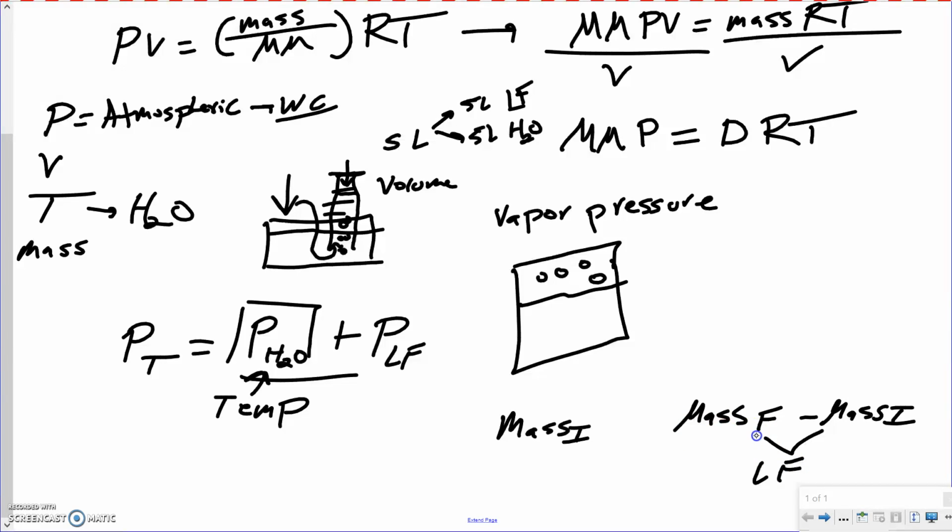Now, the hardest part of this is you are getting the lighter wet. Okay, so you have to remember that final mass will include water weight if you are not careful. You are going to have to do your best to get that thing dried as much as physically possible and to make sure that you get the water out of all the nooks and crannies. Okay, once you have that, you'll be able to do your math and get your mass of the experiment from there. Okay, so that's how we go through and find all these pieces.